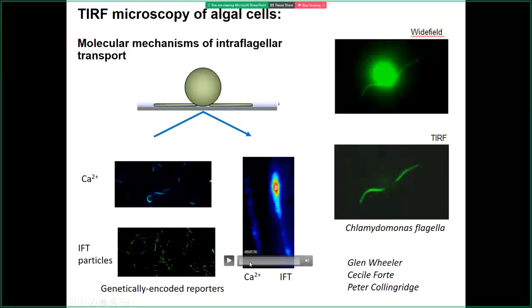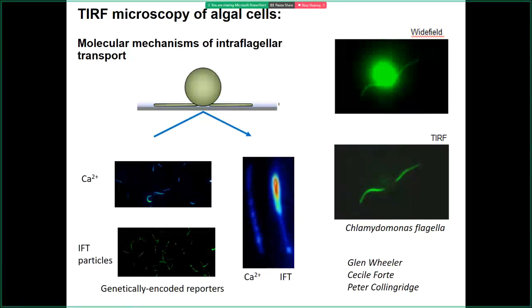I'm just going to play this image and look on the left. You'll see a flash of calcium in a second, and that flash causes those IFT particles to move away from the tip of the flagella and back towards the base. And then it all goes quiet with respect to calcium.